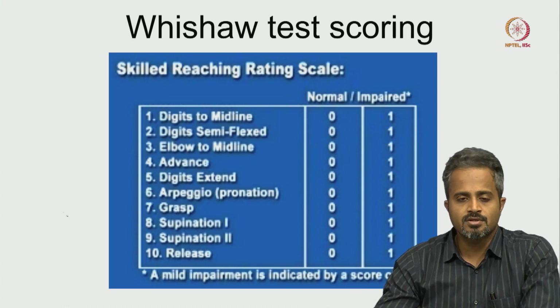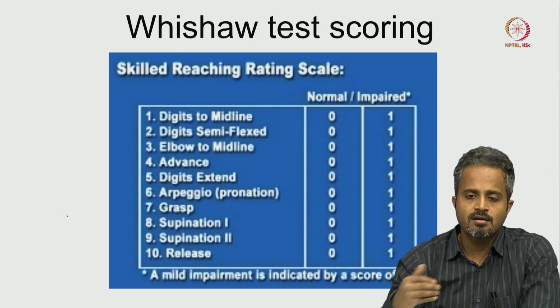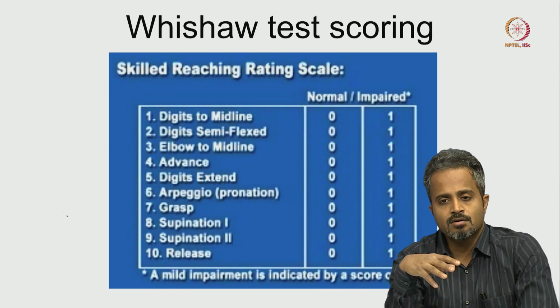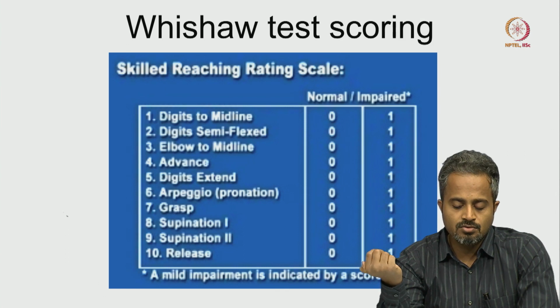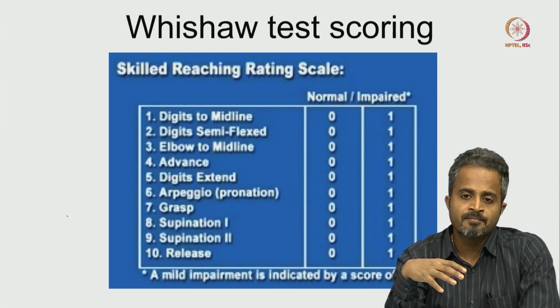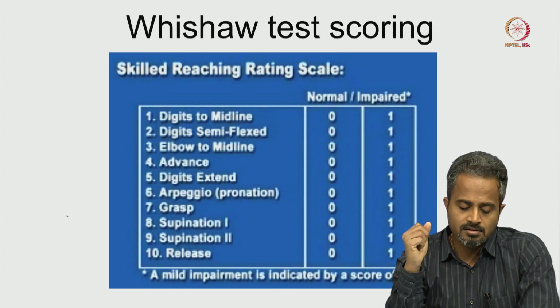Or if you are trying to bring in some translational neural engineering, you can compare with your post-intervention recordings. So that's where these test parameters matter so much.